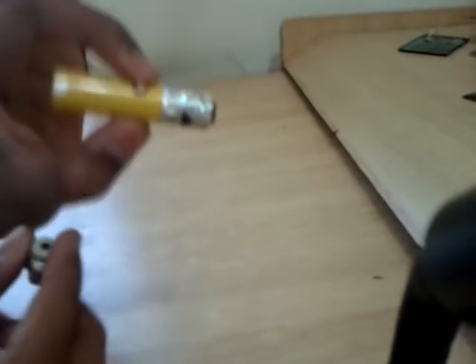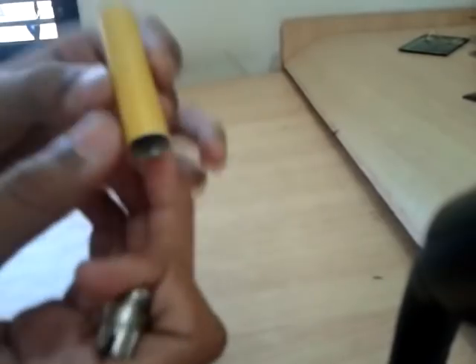Hello friends. Today I am going to show you how to make a simple microscope using a simple laser pointer.